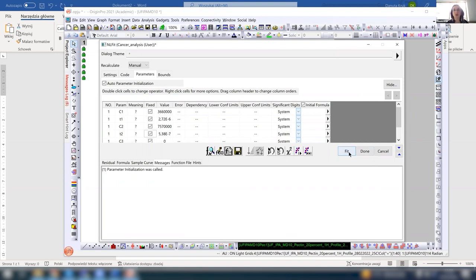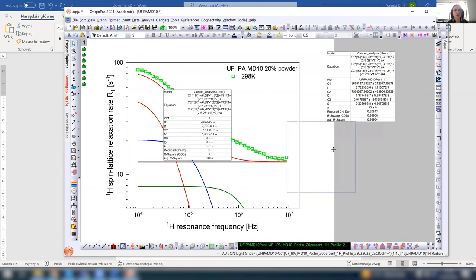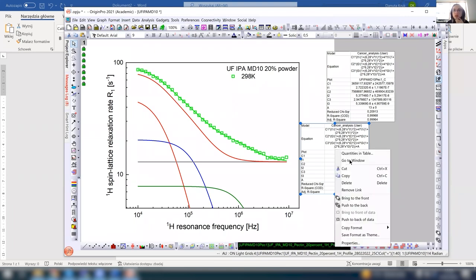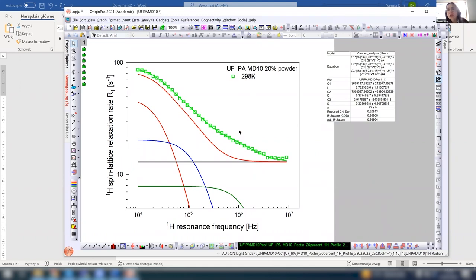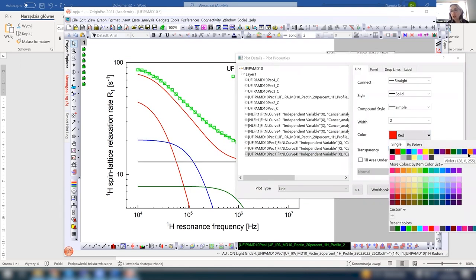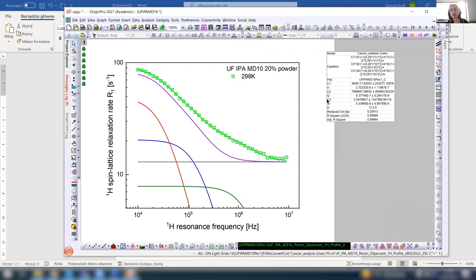Okay, what happens when I just remove those? I did something wrong, I suppose. But maybe it is so. Yeah, you see, this is indeed the reality. Look, I just plotted only those contributions without this first one. And the deviations here are huge because this is logarithmic scale. So I somehow cannot get out of that so easily. This contribution is needed.